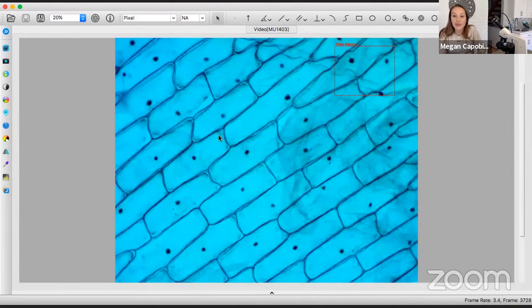That's the nucleus of those cells. And what did we talk about that is inside of the nucleus? It's going to be the DNA. Awesome, very cool. This is a really good view of plant cells, nice and clear, and we're able to actually see an organelle within that. So that's a really cool thing. All right, now I'm going to stop sharing my screen for a moment.